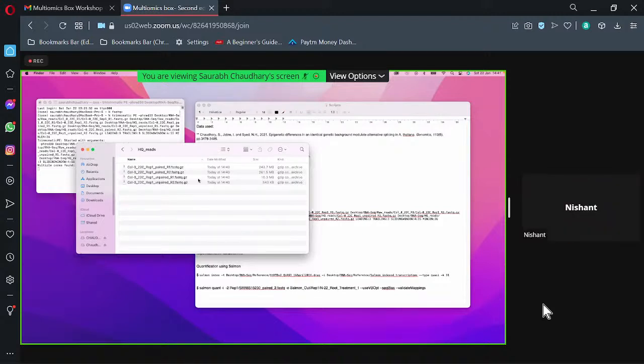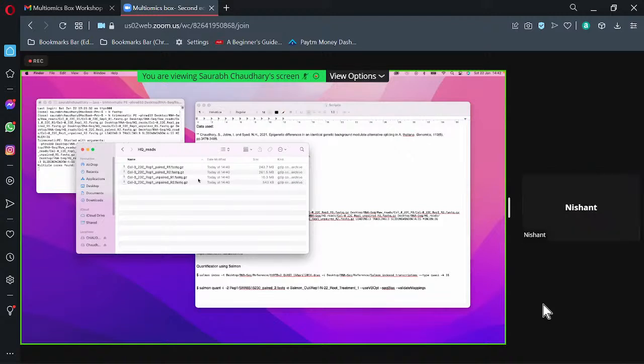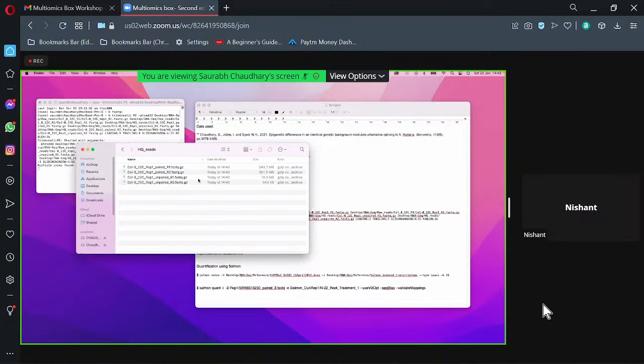The software whatever Illumina is using, I'm not aware of that. In Thermo we use Torrent Suite software. So in Illumina you must be using a software which is compatible with Illumina. The first step is you are downloading these FastQ files from the software. They will come to you as FastQ files from your Illumina sequencing, Torrent, whatever sequencing platform you use. Yes, sir. You get those files.